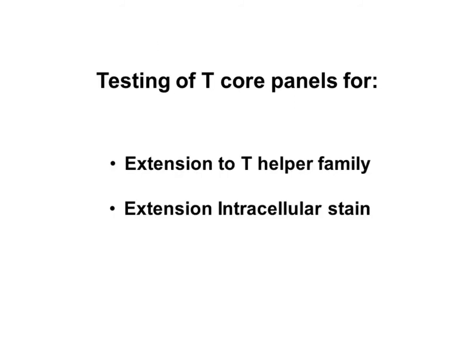So we know that the core panel works quite well, and we were able to resolve the main populations. We now want to extend it to the T-cell helper family and also intracellular staining. So we have a core panel of many markers, and imagine now that you want to use this core panel and extend it with the empty channels.